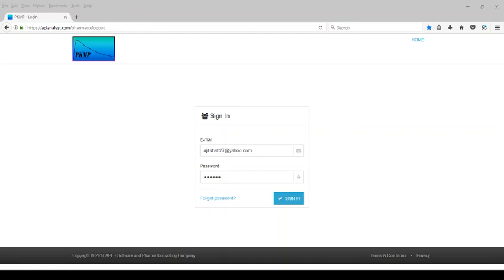Hello, my name is Ajit Shah and I'm going to show you how to perform in vitro in vivo correlation analysis, or IVIVC, using the pharmacokinetic modeling program PKMP.